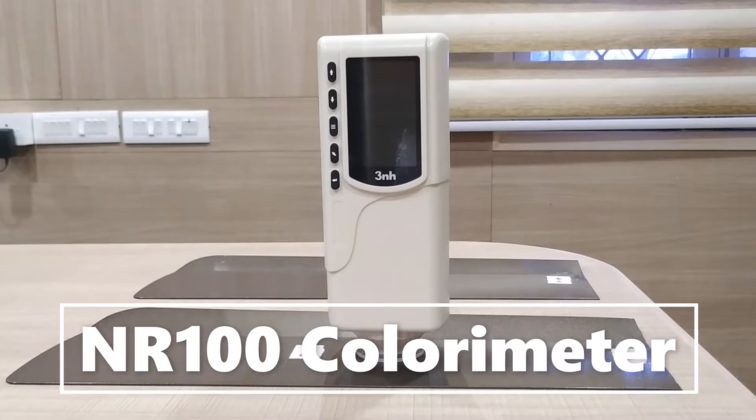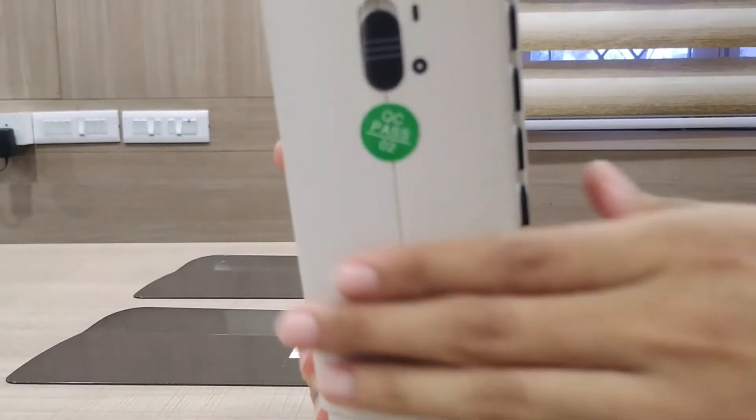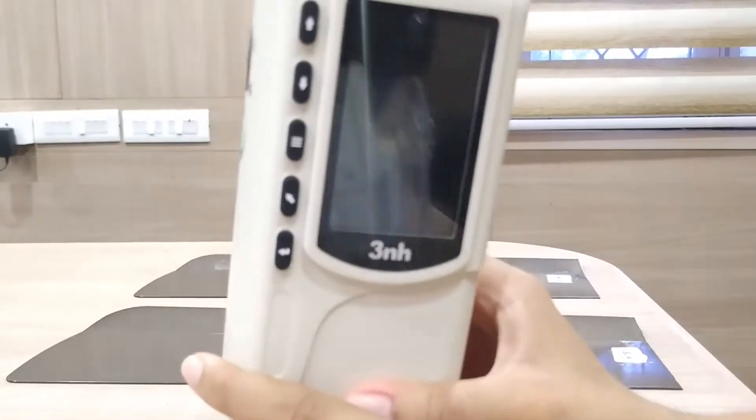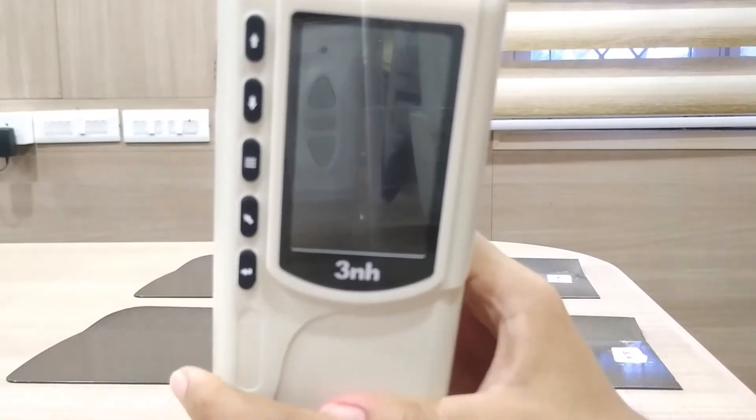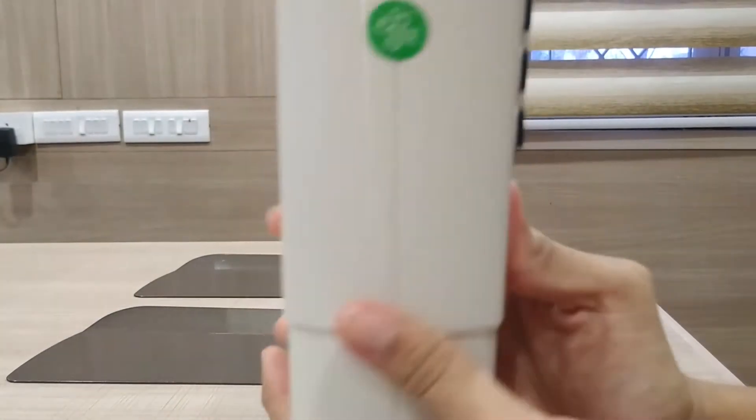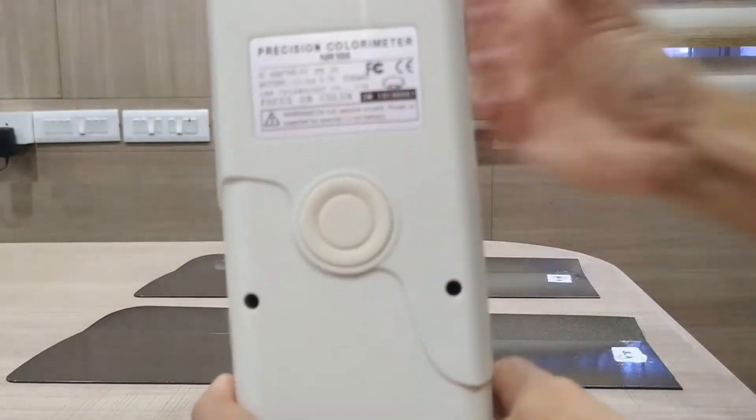This is NR100 colorimeter by 3NH. I'm going to switch it on. In this instrument you can measure color by pressing on this button at the back.